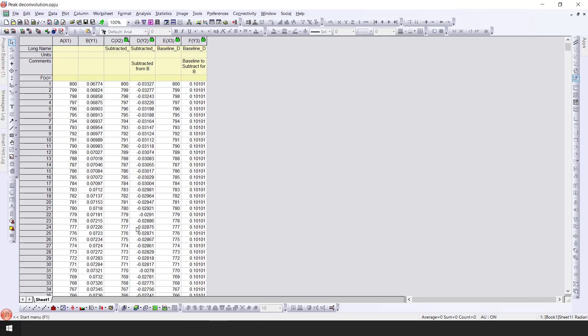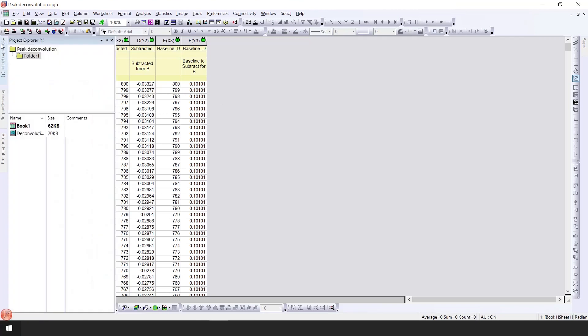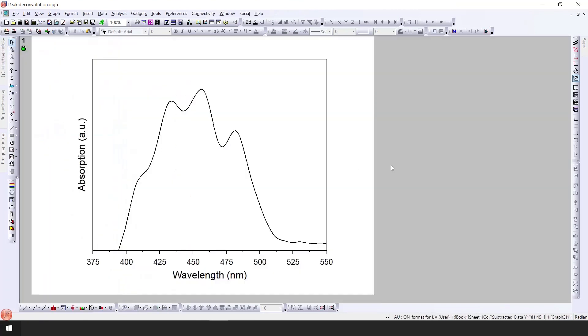Let's start the deconvolution of the peaks. Step number one is to plot your data. In this case I have the absorption data of yellow bell paper. This is the absorption from the yellow bell paper. On the x-axis we have wavelength and on the y-axis we have absorption.